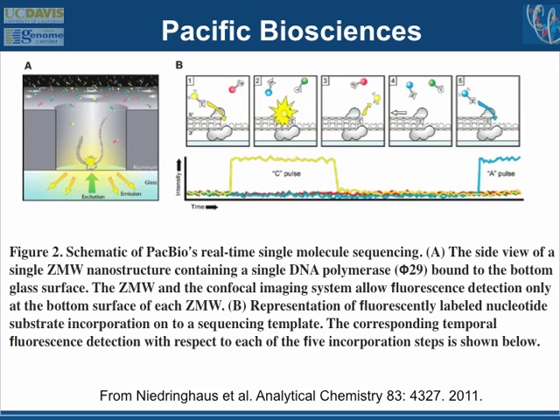It has an incredibly poor accuracy. The method is very, very inaccurate, but if you need scaffolding or large pieces of DNA for some purpose, again, like assembling genomes or doing haplotype structure or some other purpose, this is a very good complement to Illumina sequencing. So you use Illumina sequencing to get coverage and PacBio sequencing to get large pieces of DNA. You correct the errors in the PacBio sequence from the Illumina data, and you use the PacBio data to get your scaffold for a genome of interest.